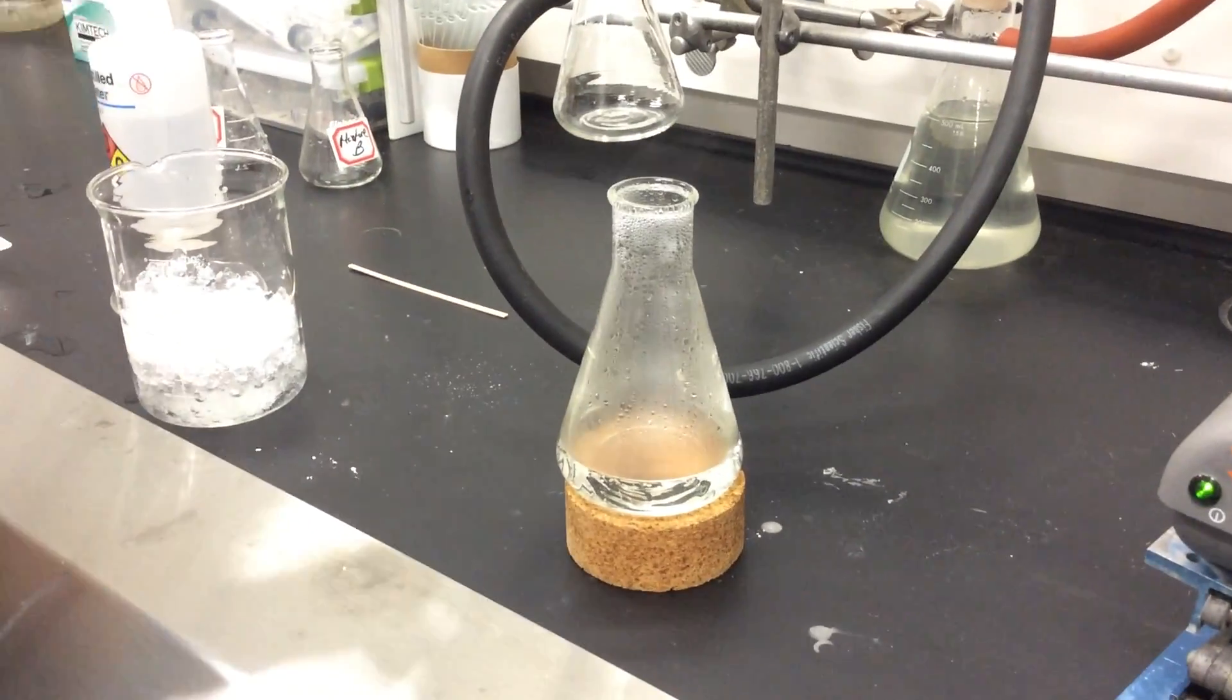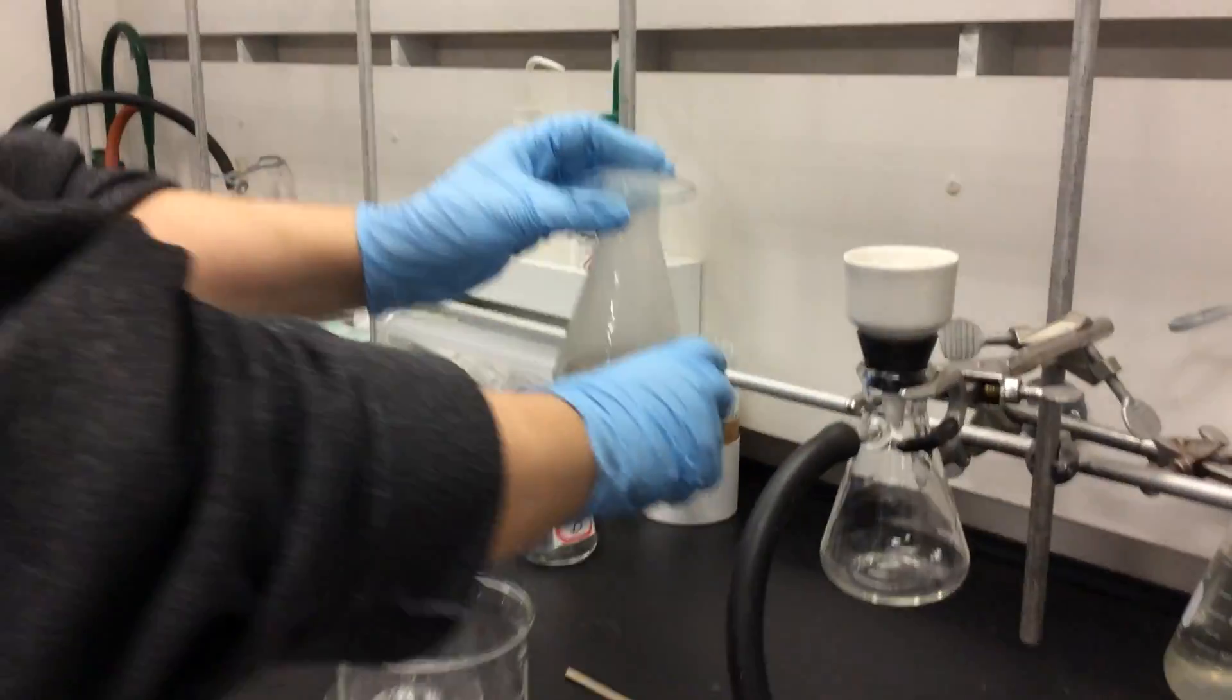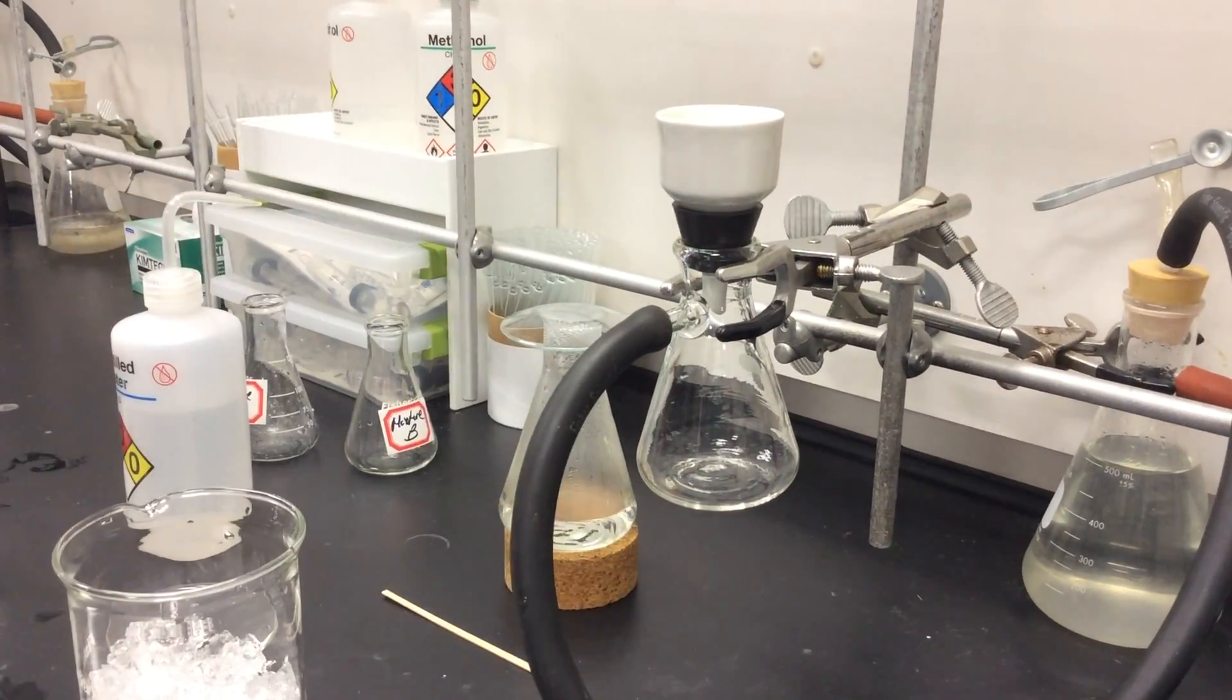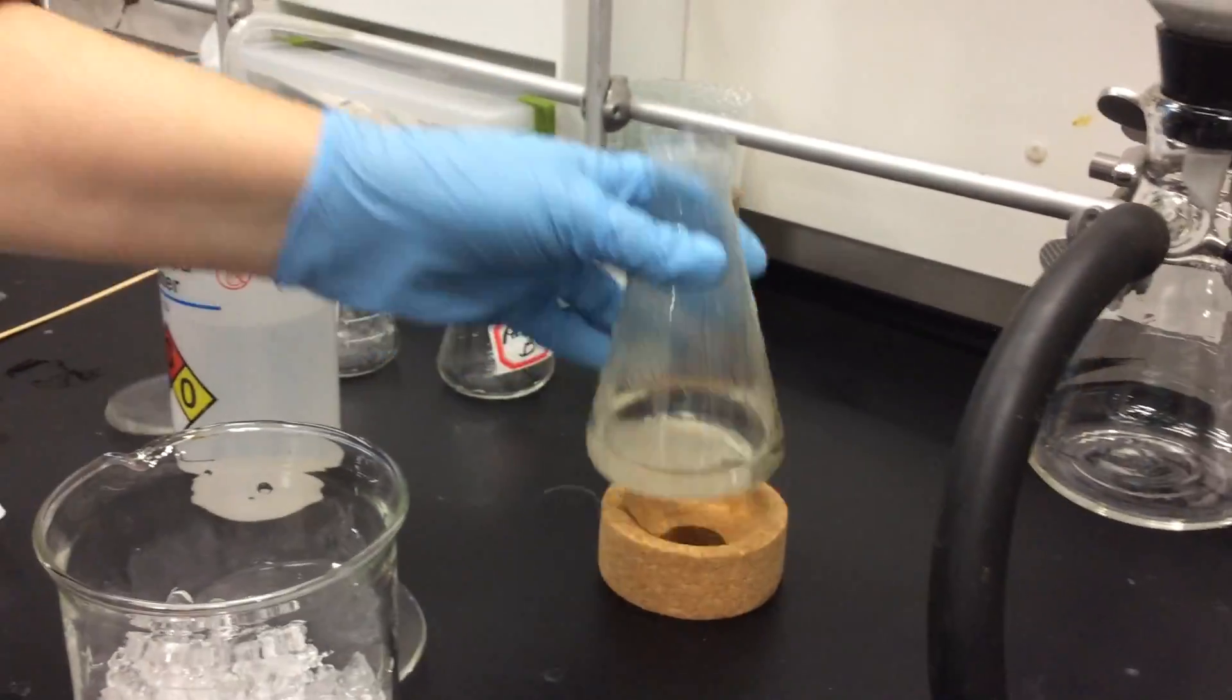Now what we're going to do is we're going to take a watch glass, cover the Erlenmeyer with the watch glass, set it at the back of the hood to cool. We use the watch glass to cover it so no impurities or dirt can fall in.